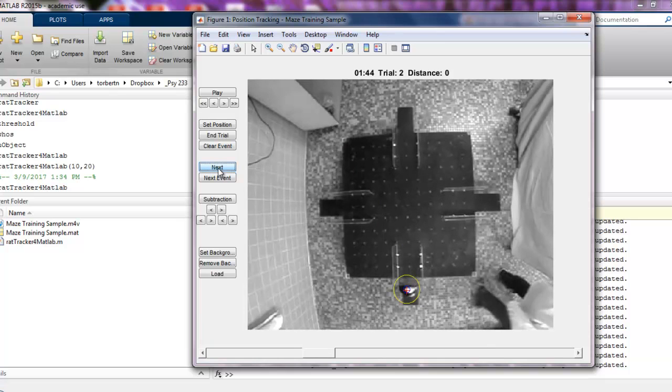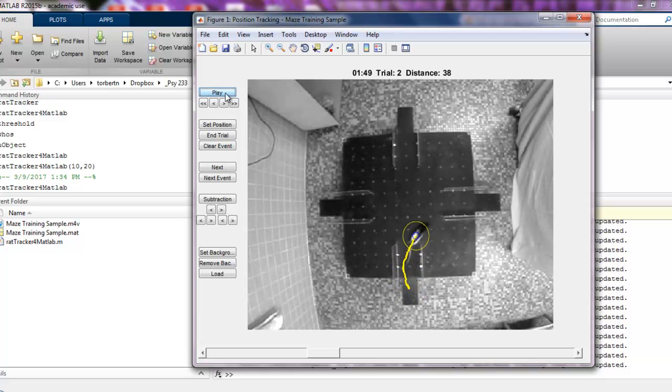And from now we need to finish our tracking, and since we've set up the beginning and the end of each trial, if I hit play at this point, the tracking will continue, and I just need to let this video play through the end of trial 3. At this point you can do other things while you wait. It does need to run through because the program's actually calculating the position as the movie plays. It may not run exactly in real time because it takes some time to process each frame. But hopefully it doesn't run too much slower than real time.